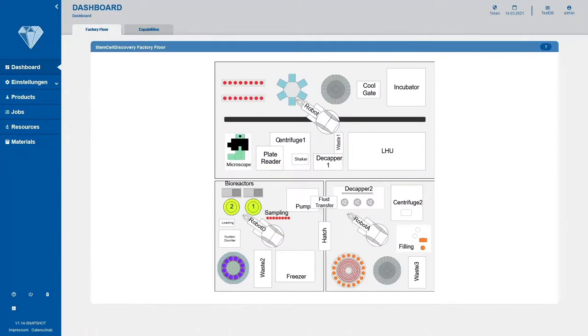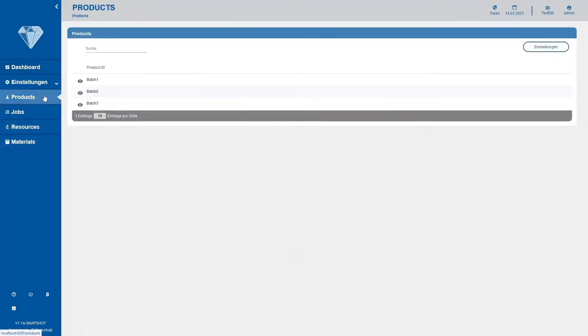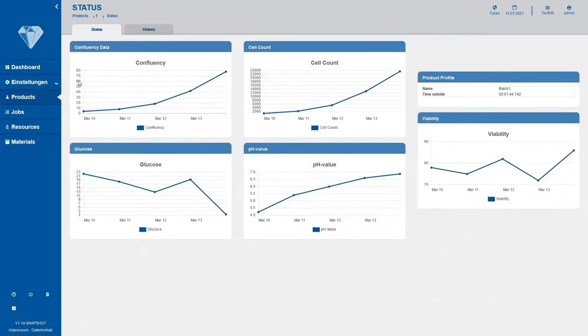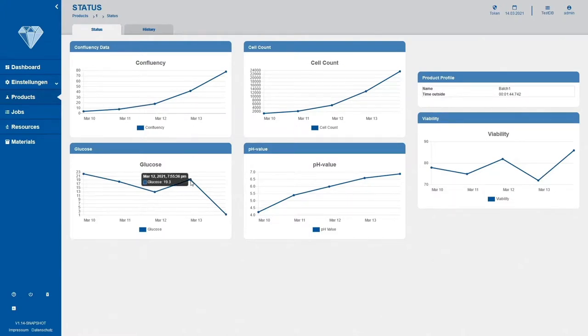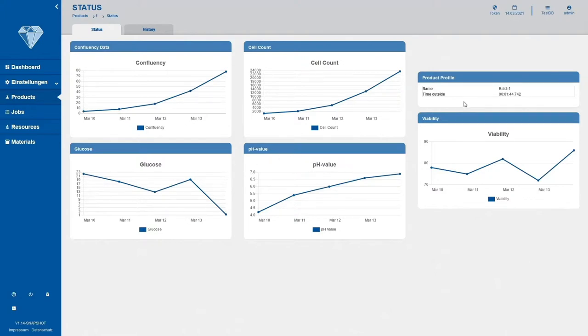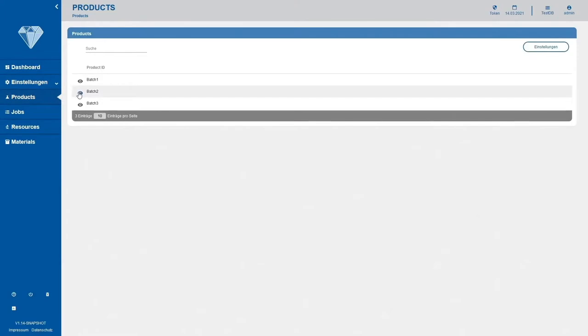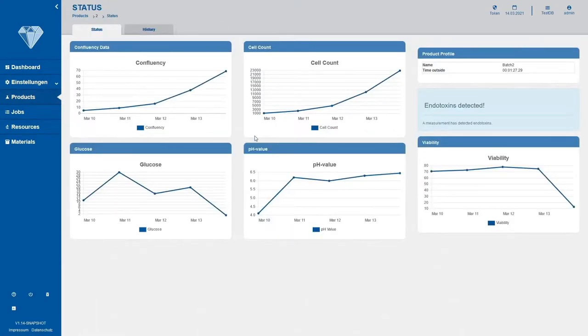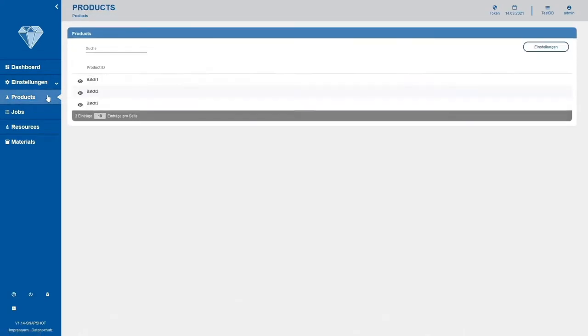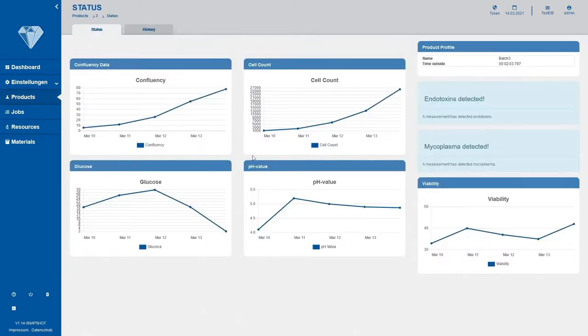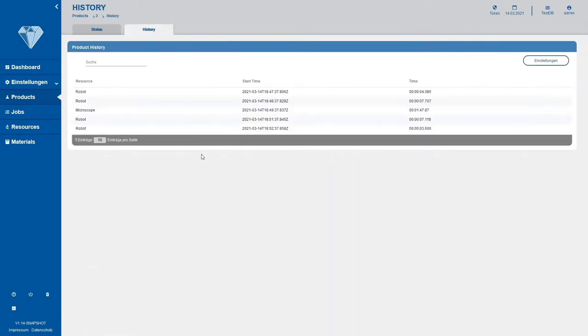Next up are the product details pages. We can navigate to the products details pages using an overview. We are presented with graphs for confluency, cell count, glucose, pH value and viability, showing the development of the batch over time. Additionally, there is a product profile with the name of the product and the time it has spent outside the incubator. There are also boxes in case endotoxins or mycoplasma are detected. The product also has a history, showing the station a product has visited and for how long.